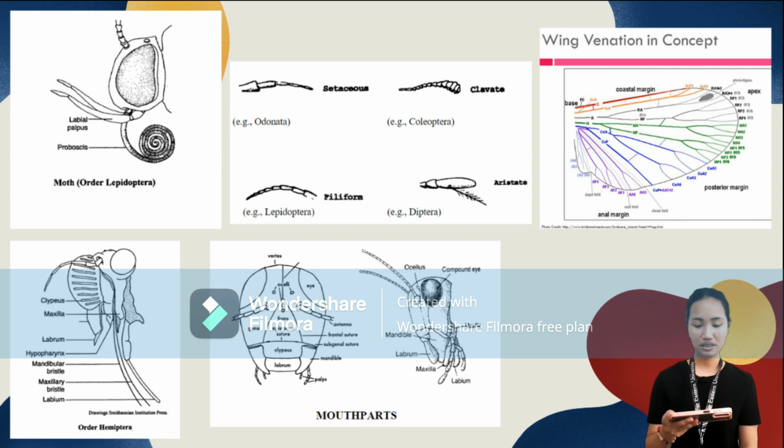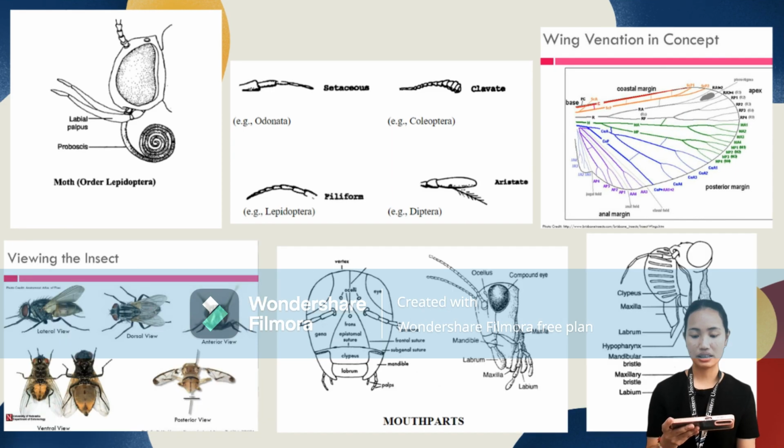As part of our activity, we discussed the external parts of invertebrates, such as insects and arachnids. A specimen was examined by us using a microscope so that we could become acquainted and familiar with it. Insect parts, such as antenna, mouth parts, eyes, wings, and ovipositors, were observed through a microscope. Then we were given instructions to sketch, color, name, and explain the significance of these features.